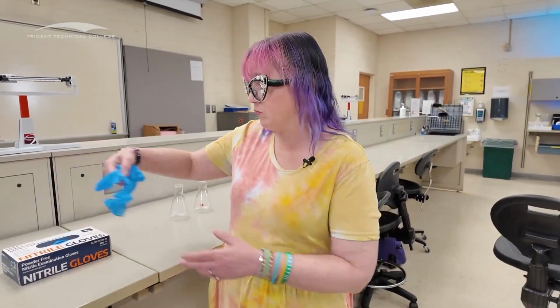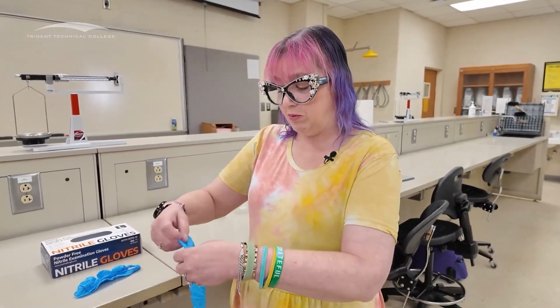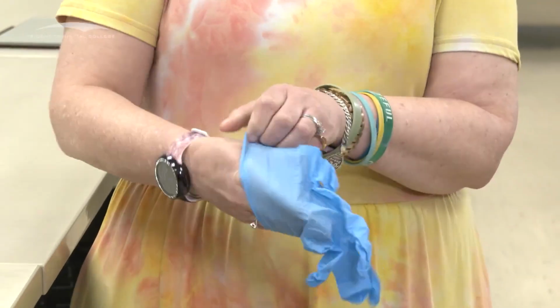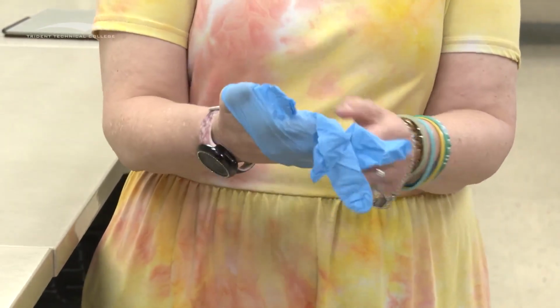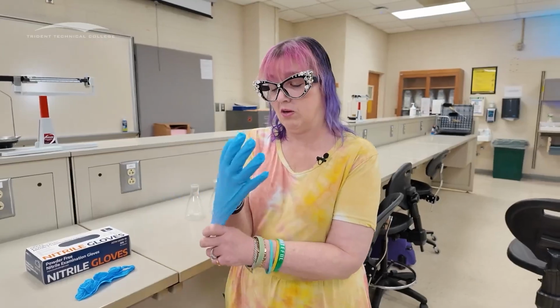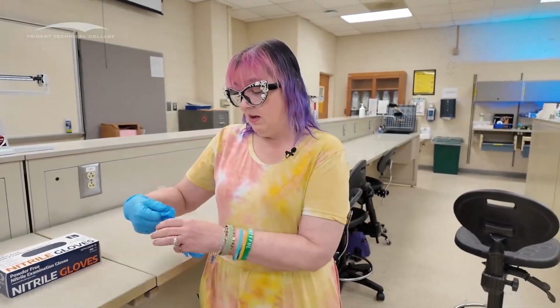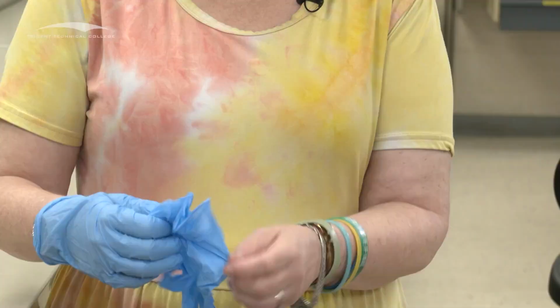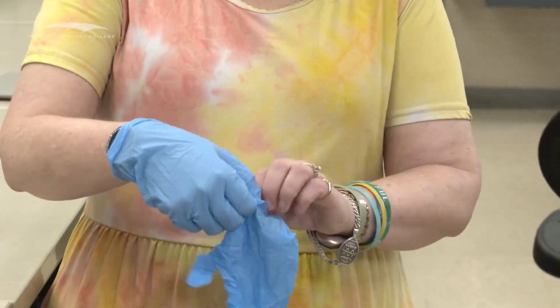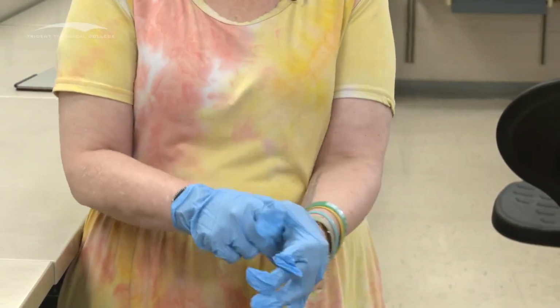We're going to take gloves out of this container. Here's 1, here's 2. I'm going to set those down. We're going to make sure that we put them on appropriately. We want to make sure that we get our thumbs into the thumb spots on our gloves. So that's 1. I want to get that over my watch because I want to make sure I don't kill my watch while I'm wearing it. And then I have my second one, if I can get this thing sorted out because they're all shoved in there, not necessarily easy to put on.